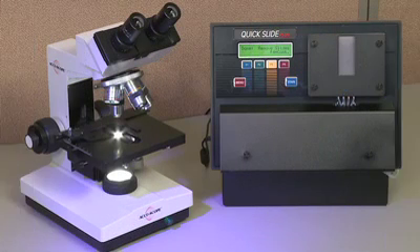The Quick Slide Plus is a single-slide stainer with a footprint of only 1 square foot and weighing less than 10 pounds. It can be placed next to your microscope.